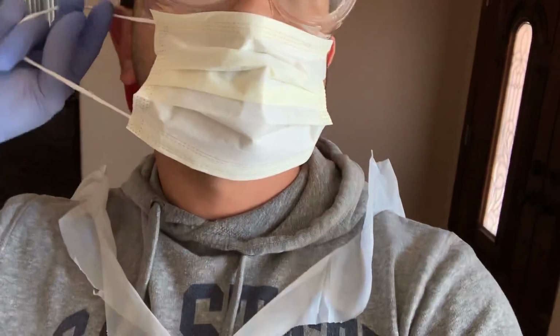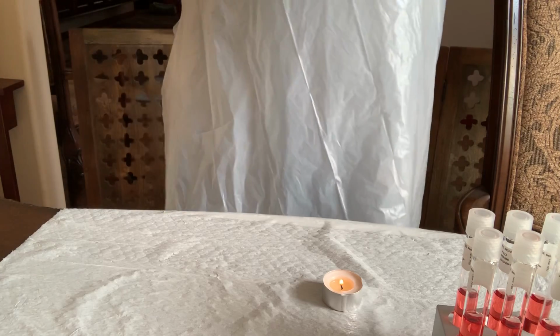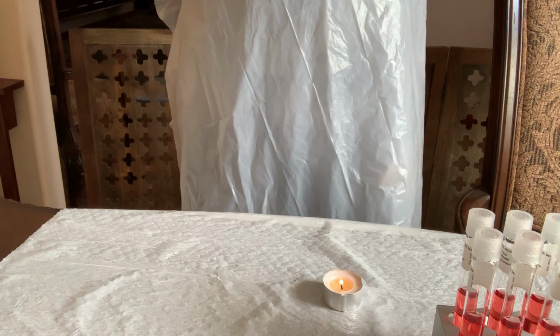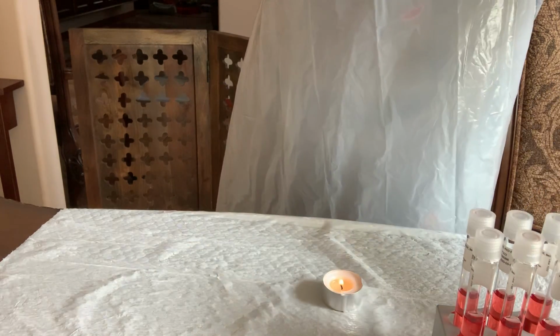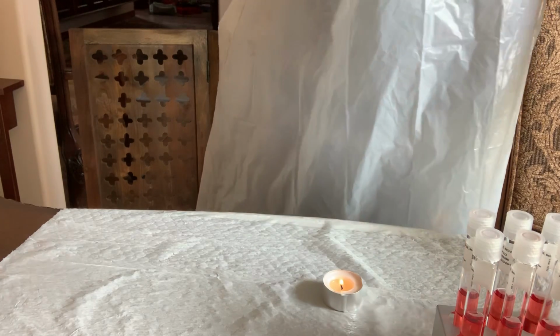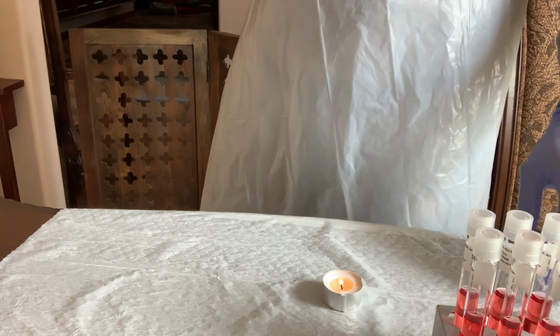I'm going to throw on my face mask, and then let's get going onto our lab. Okay. So this is pretty much what we're looking at. Here we've got a candle so we can inoculate everything. Essentially what we're going to be doing first is I'm going to take out the Durham tube and let it dry real quickly. As the Durham tube dries, I'll place it down there. It's been soaking in alcohol for a bit.